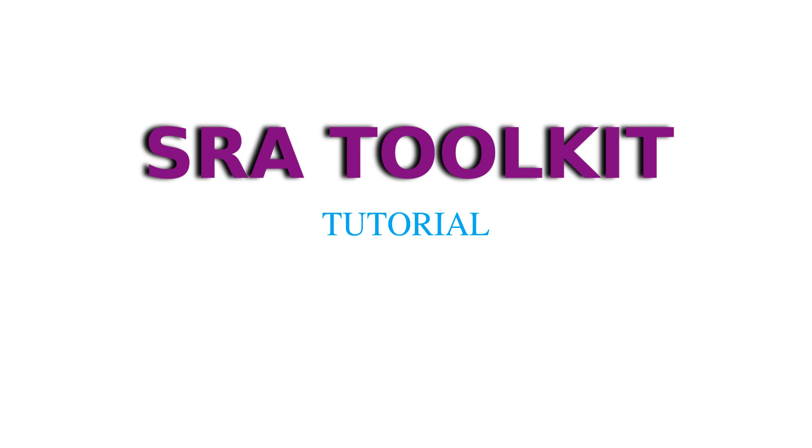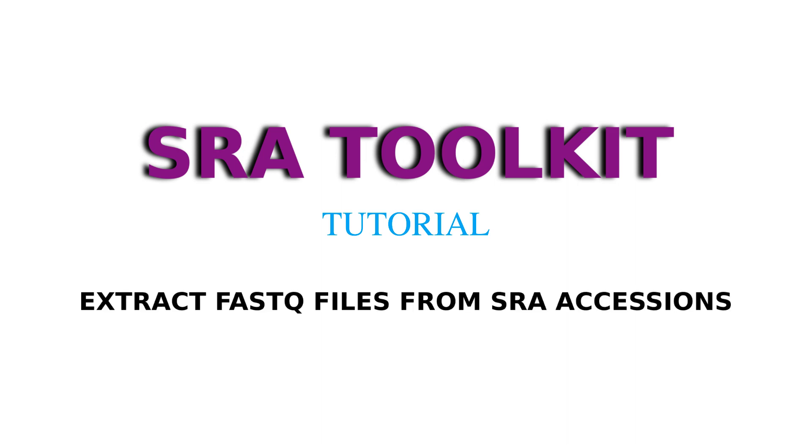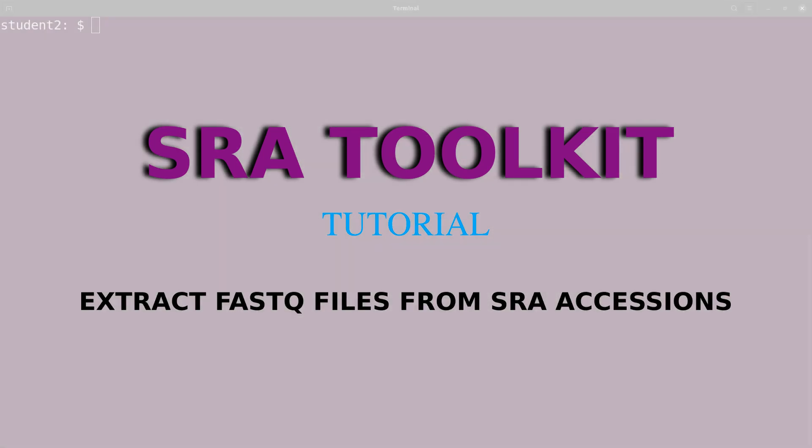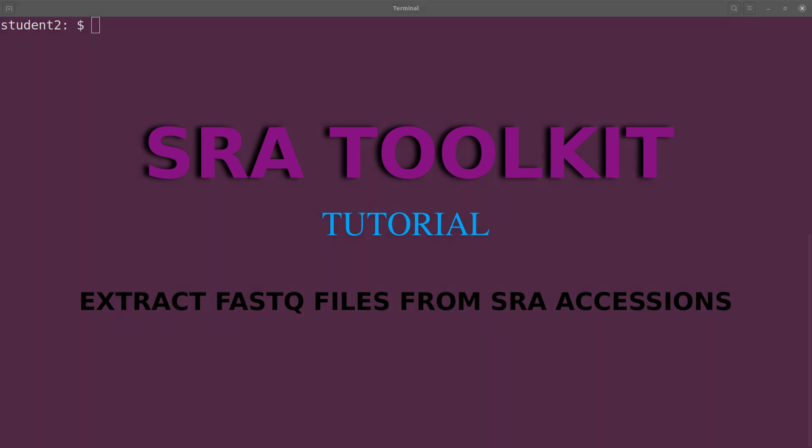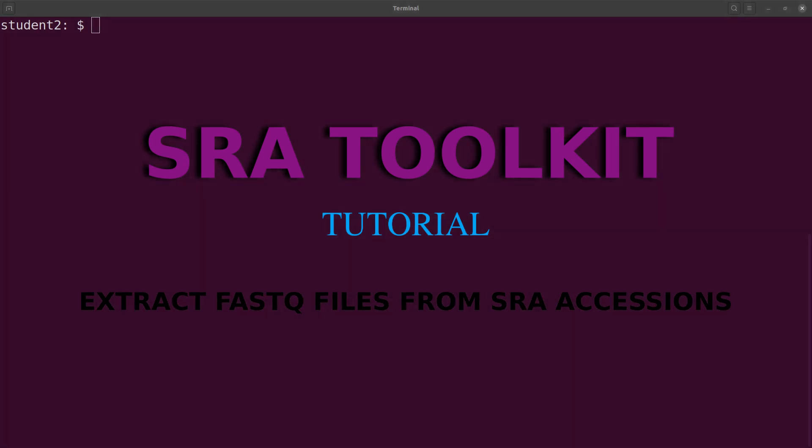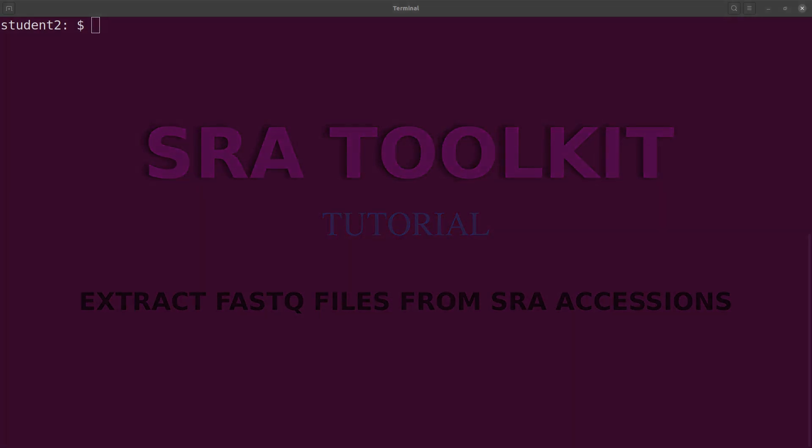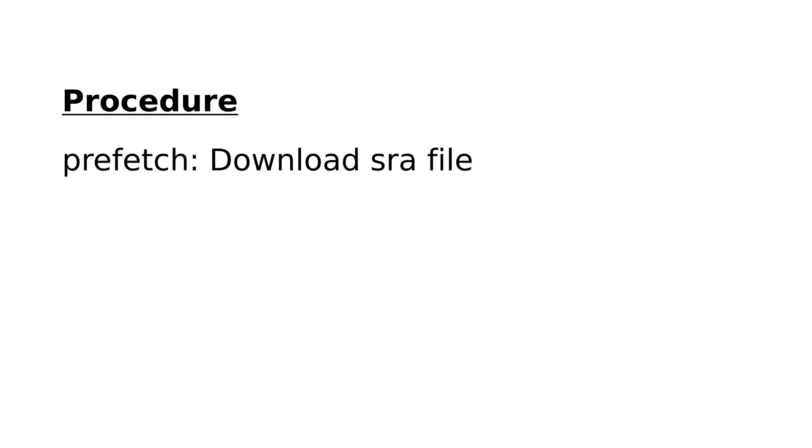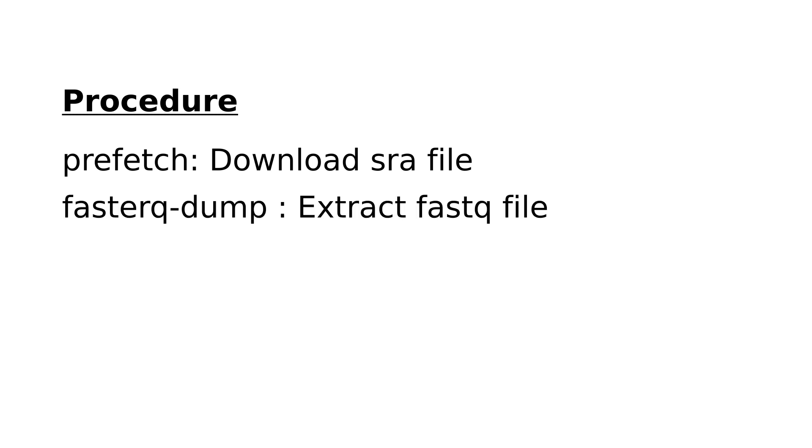Hi everyone, welcome to another episode of the SRA toolkit tutorials. In this video, I'm going to show you how you can extract FASTQ files from SRA accessions. To do the extractions, you need to first do a prefetch where you download the SRA files, and then you use fastq-dump to do the extraction.